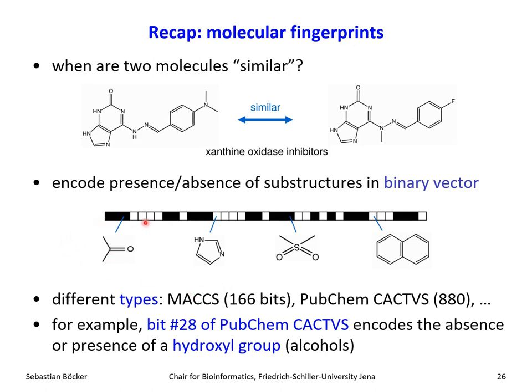You simply check whether or not the substructure is part of your molecule, yes or no. If it's in there, you put in a 1. If it's not in there, you put in a 0. And afterwards, to compare two molecules, you simply have to compare the binary fingerprints, which is relatively easy. That then leads to so-called Tanimoto coefficients.